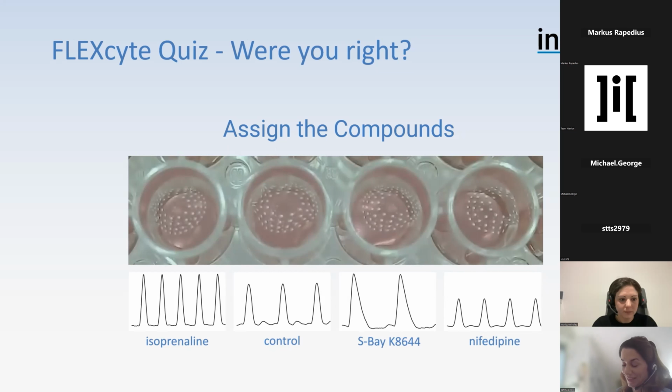Thank you very much, Marcus. So, more questions, really nice. Takasuna-san is asking if you can co-culture smooth muscle with endothelial cells. We expect that you will evaluate the acetylcholine-induced EDRF effects. Okay, well, that sounds interesting, but we haven't done that yet, so I can't comment on that. But it's a good hint.